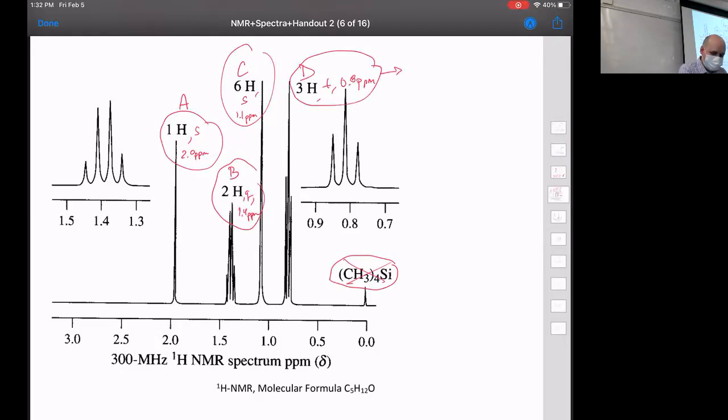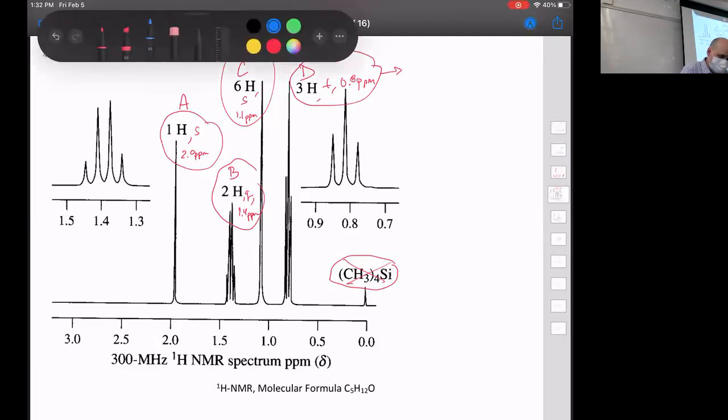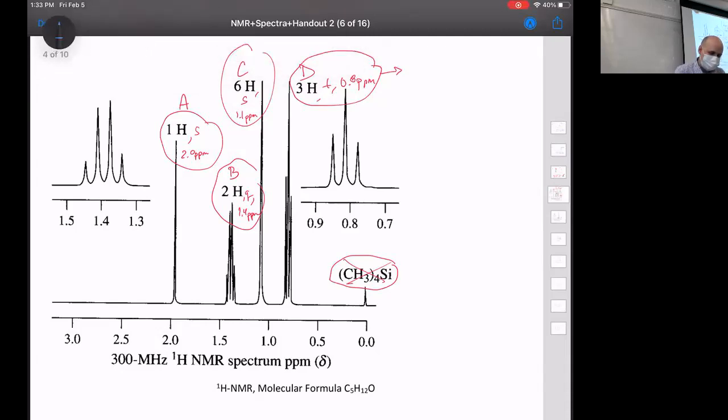All right, so the shift suggests that it's entirely made of like alkanes with no functional groups. Perfect. So yeah, he just said 0.8 means it's next to nothing really, okay?